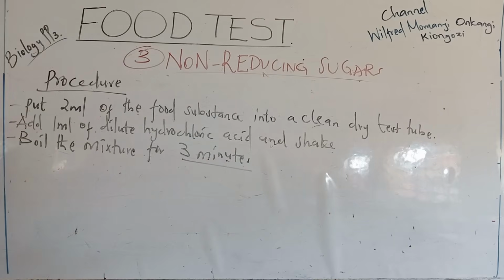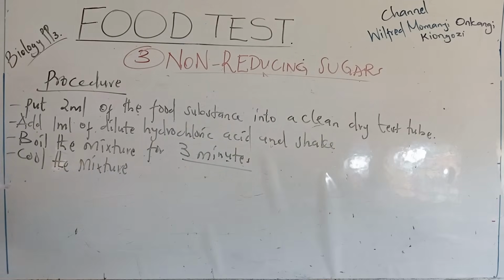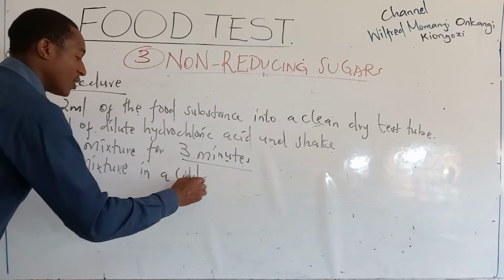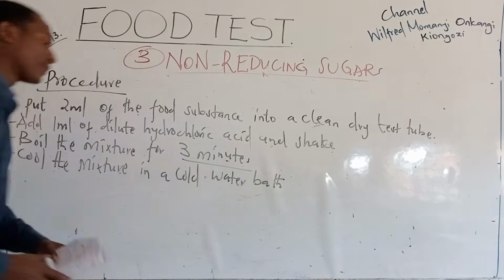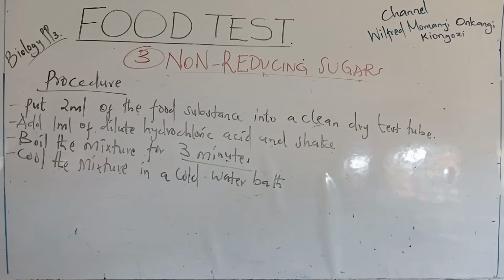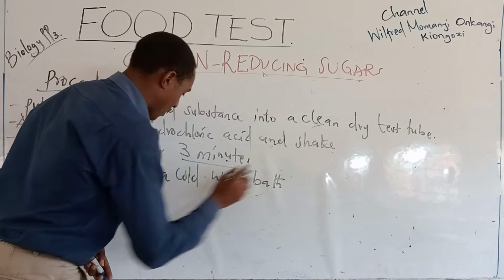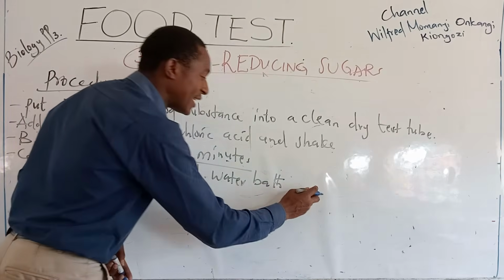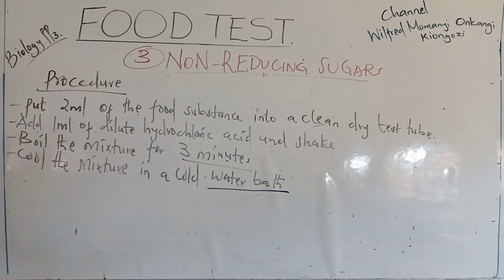Then after boiling, cool the mixture in a cold water bath. There are several methods of cooling the mixture. You can open the tap, and as the cold water is running, you cool that mixture. But mostly we talk about a cold water bath.